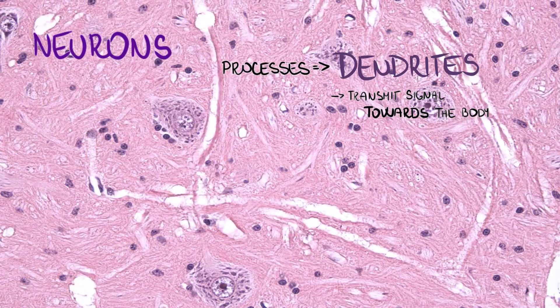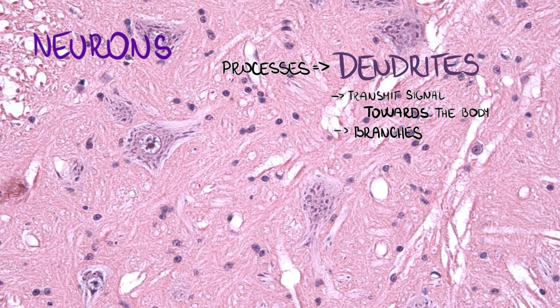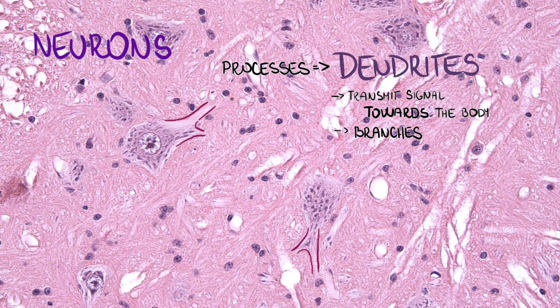Dendrites, on the other hand, branch a lot. Sometimes we can see the branches, sometimes we can't because they are too thin, but they do contain the Nissl substance.